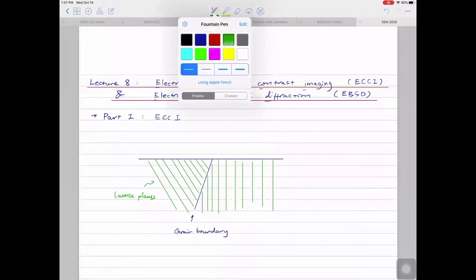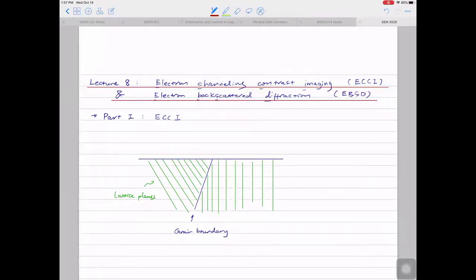Above the surface, we have the electron beam coming into the material. Focus on the grain on the left. The electron beam will travel into the material, then bounce back as the backscattered electron. So this is the electron. As the beam scans across the specimen surface, the beam has now moved to the grain on the right. Let me ask you, can the electron travel deeper into the material, or shallower, before the electron gets spit out? Take a guess. Can the electron travel deeper or shallower in the grain on the right with the same beam energy?